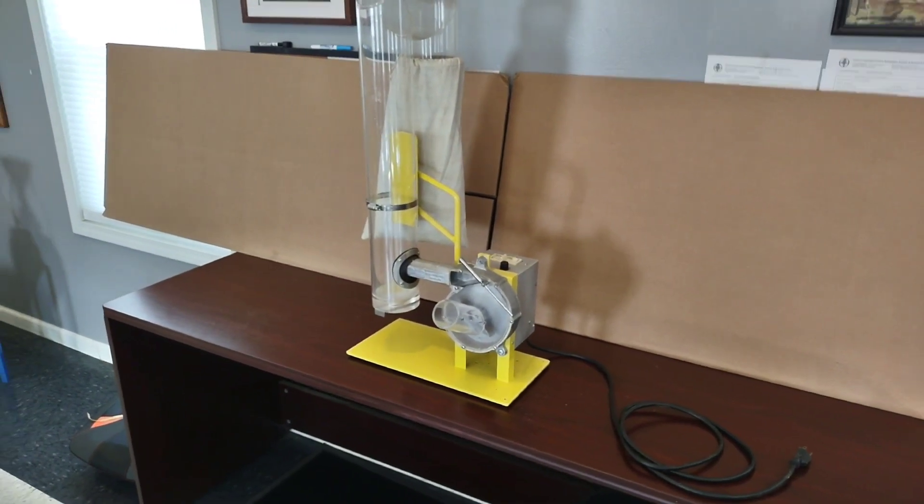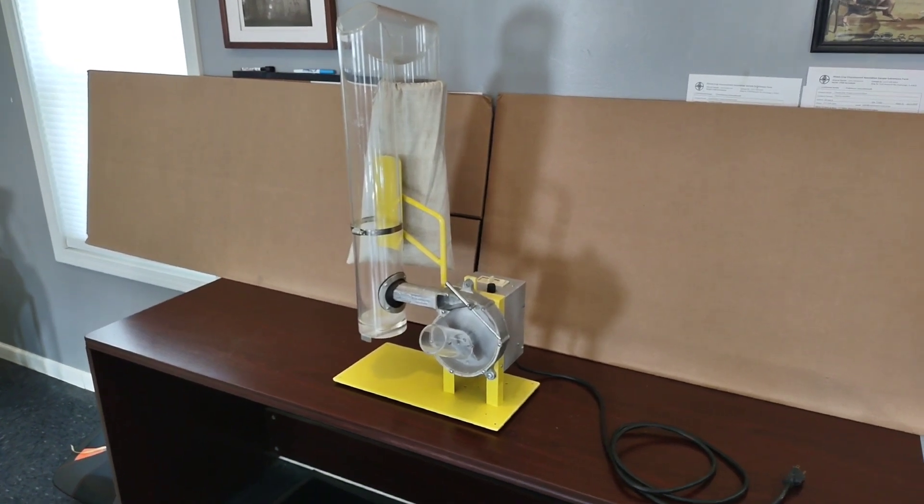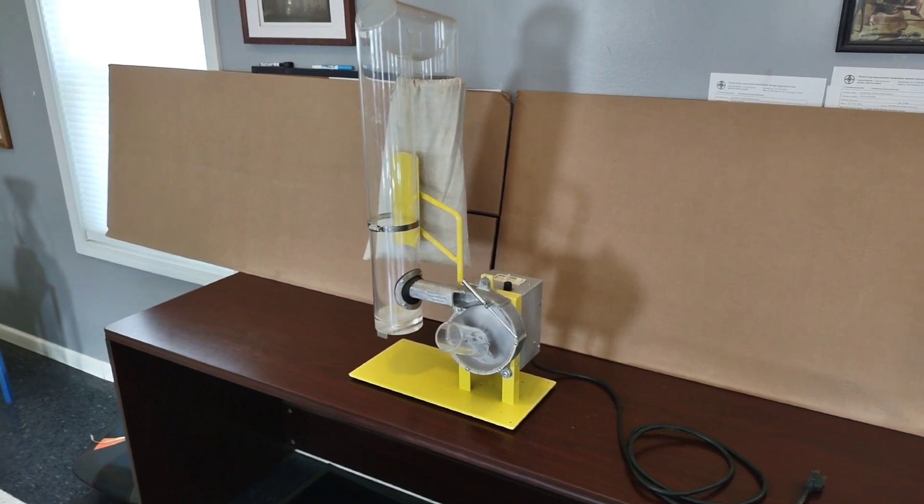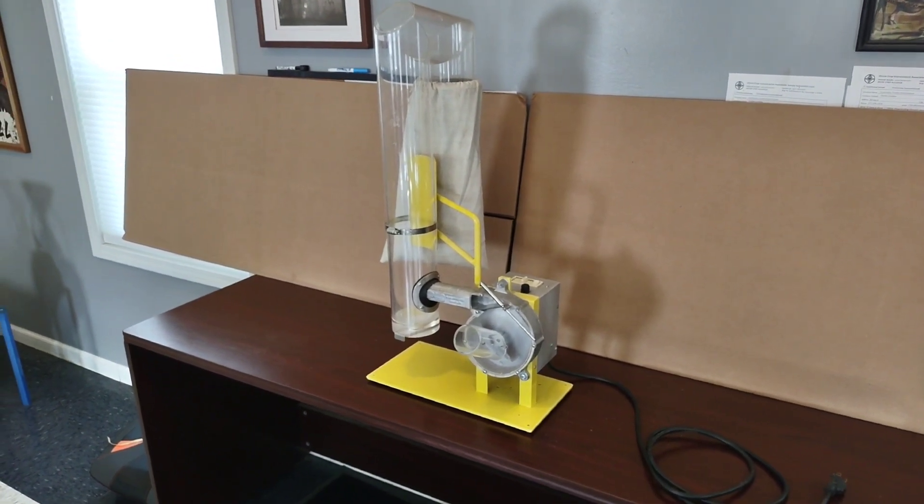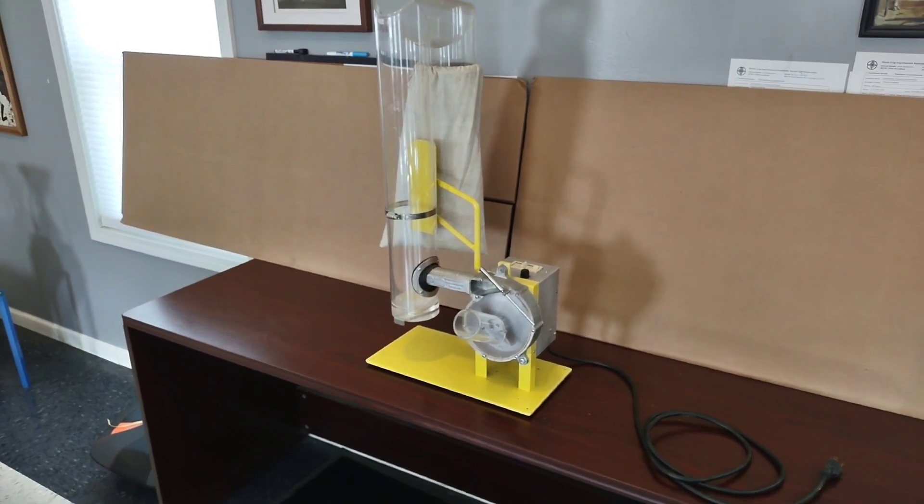Today we are looking at a Precision Machine Company wheat head thresher. This thresher is designed for plant breeders to thresh wheat or other small grains, one to six heads of wheat at a time.